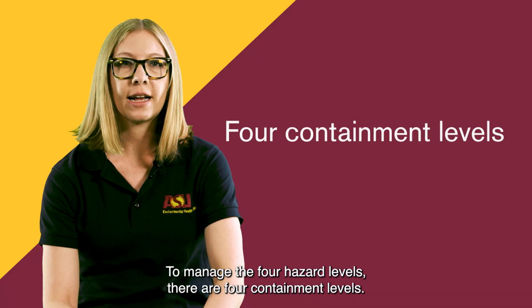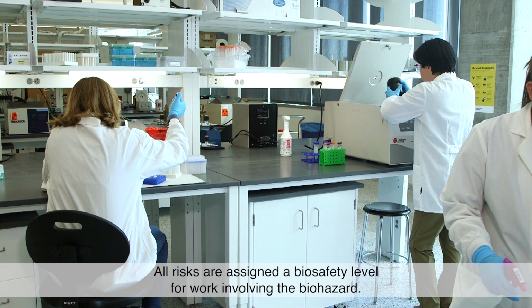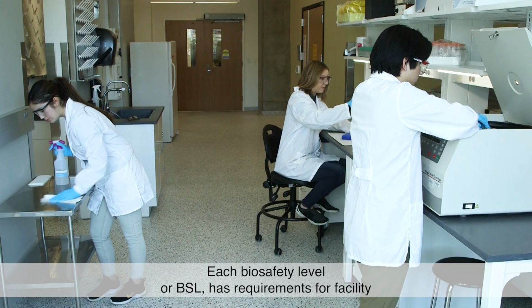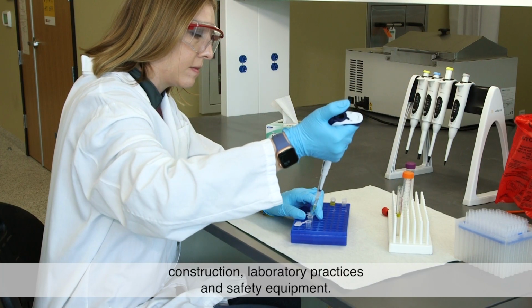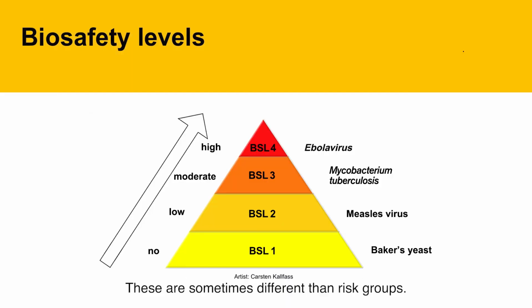To manage the 4 hazard levels, there are 4 containment levels. All risks are assigned a biosafety level for work involving the biohazard. Each biosafety level, or BSL, has requirements for facility construction, laboratory practices, and safety equipment. There are 4 biosafety levels assigned for containment and protection. These are sometimes different than risk groups.